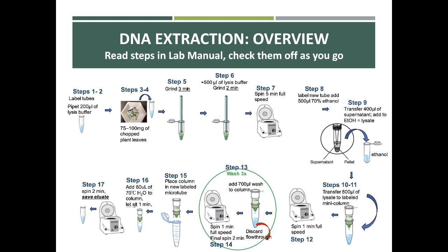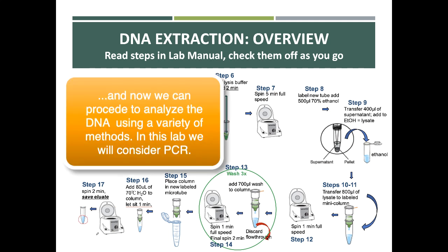Often when students are working in my lab and they do a similar procedure and they don't get any DNA, I always ask them about this step here. If you don't let it sit, you don't give that water enough time to go through the column and solubilize the DNA. You spin it, and in this tube right here, you have DNA in solution.